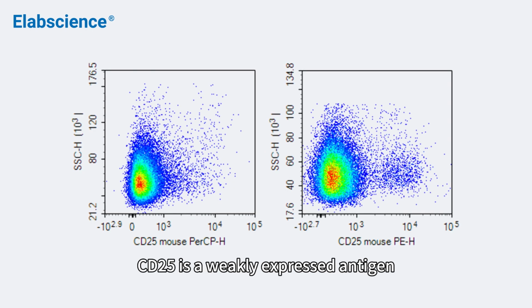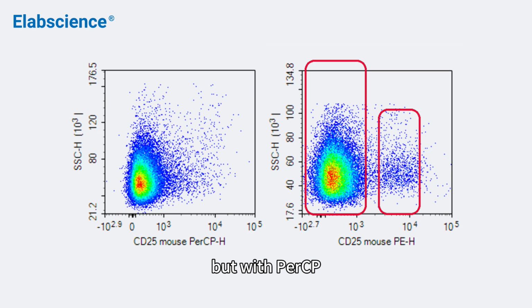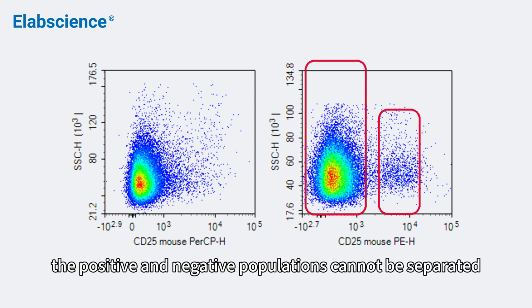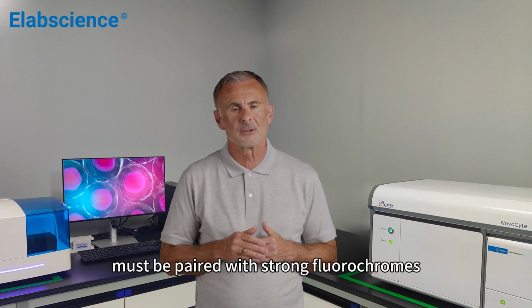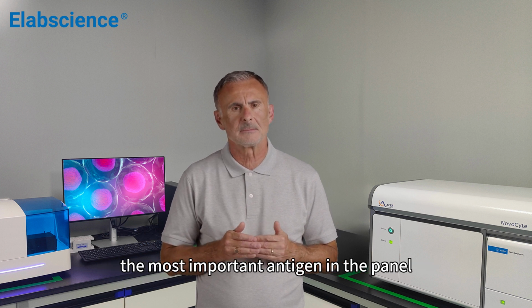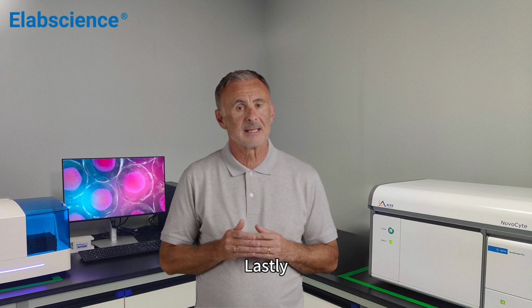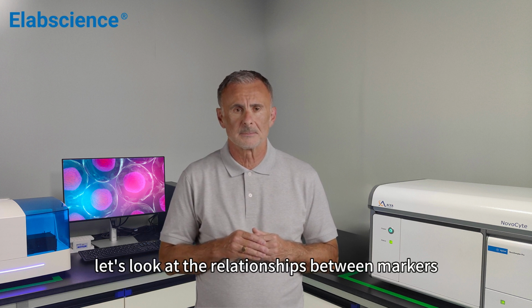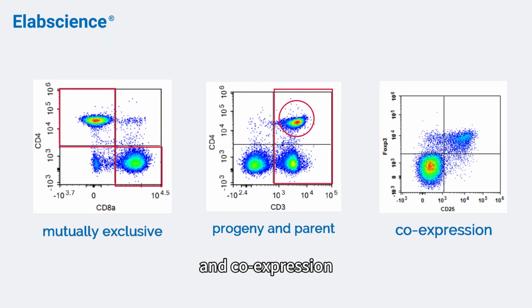CD25 is a weakly expressed antigen. Using PE, a strong fluorochrome, the separation is clear, but with PerCP, a weak fluorochrome, the positive and negative populations cannot be separated. Therefore, weakly expressed antigens must be paired with strong fluorochromes. If the expression level of the antigen is unclear, the most important antigen in the panel should be paired with the strongest fluorochrome. Lastly, let's look at the relationships between markers: mutually exclusive, progeny and parent, and co-expression.